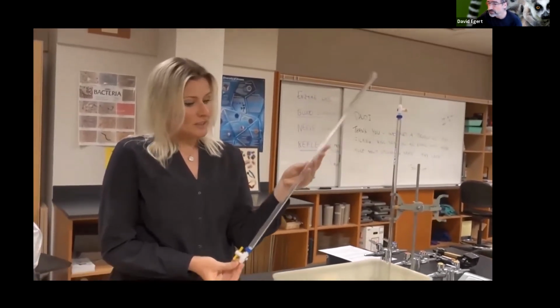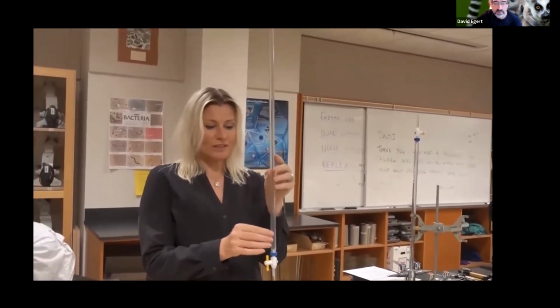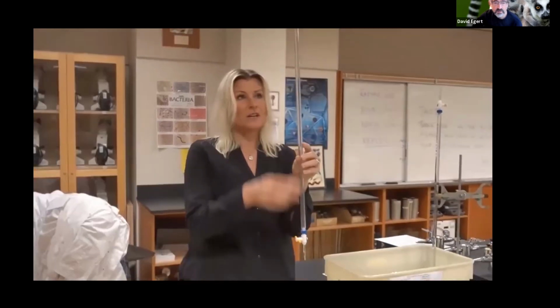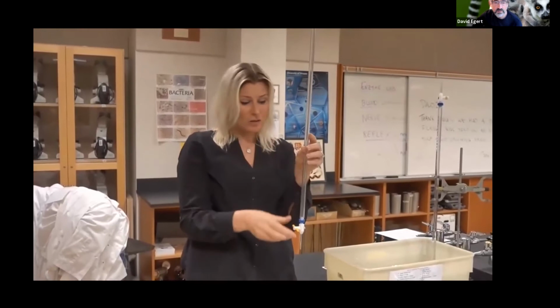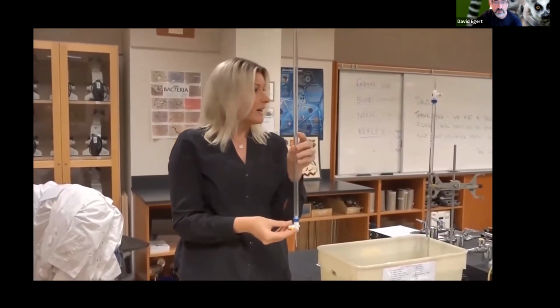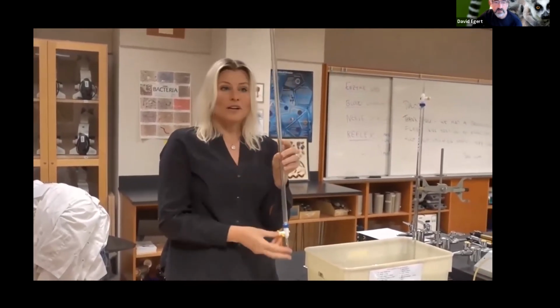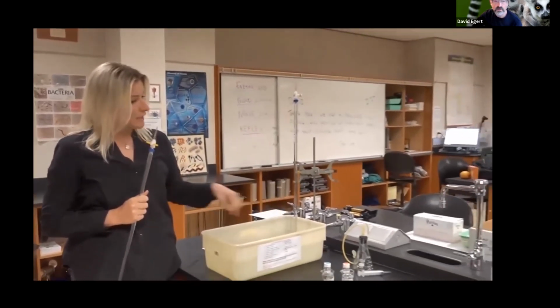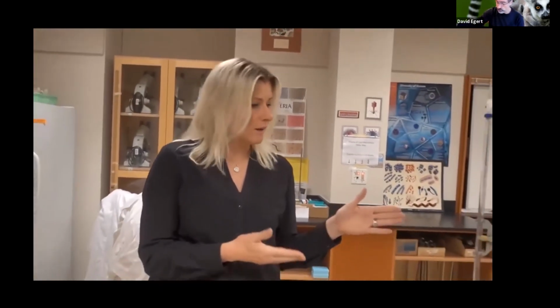Most often in chemistry lab you would have used it this way, where you can open or close it and maybe do a titration. But in our lab, we're going to use it upside down. That's what I clamped in here. I also filled it with water, and we'll show you the technique for how to do that later.